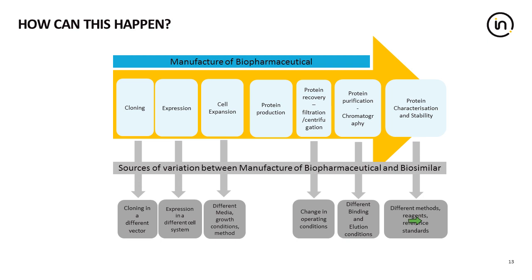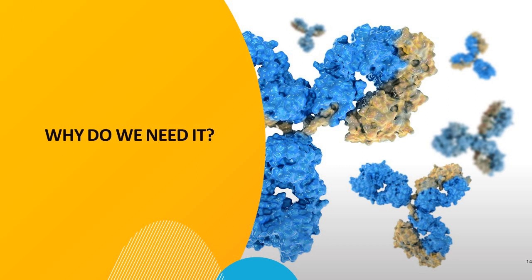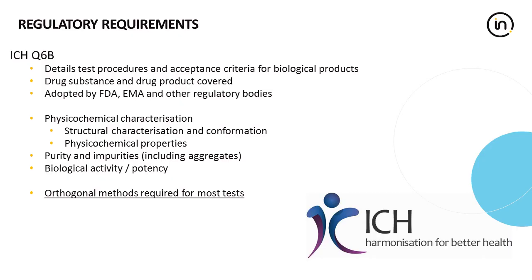So this brings me to the next part of my topic, where we're going to discuss why we need it. We have so far seen that there could be many reasons for a protein to lose its activity, which is good enough reason to go for as much characterization as possible, especially if you're developing a biosimilar. However, there are regulatory requirements as well that ask a submitter to support the application with relevant data.